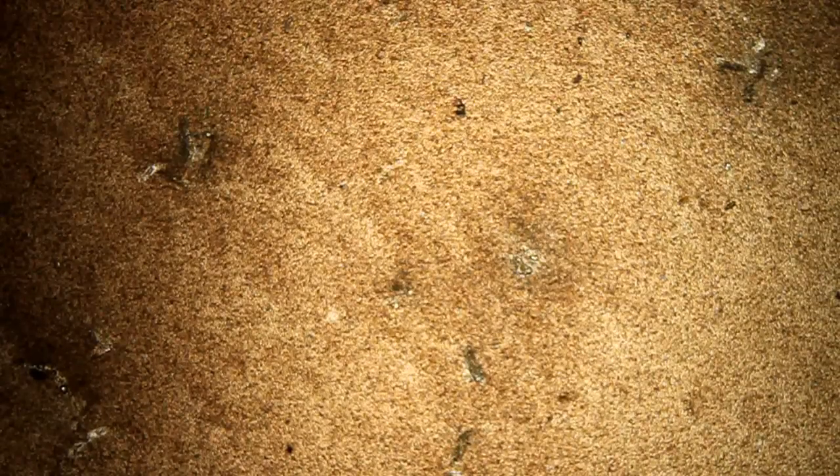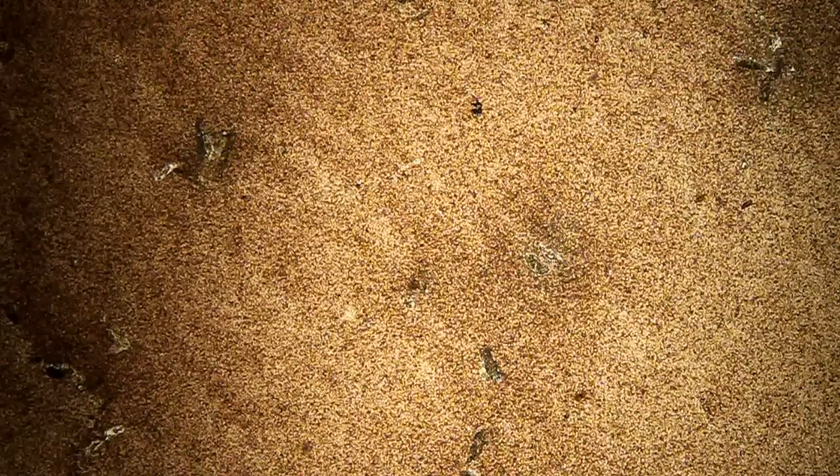I'm using a Canon T1i with a 1.6x crop sensor. This is a Nikon Plan 4x objective lens on the Nikon Fluofot scope. The adapter on the camera has a 2x adapter lens in it and obviously it's not tuned for these Nikon objectives. So I'm pretty sure that's where the chromatic aberrations are coming from.